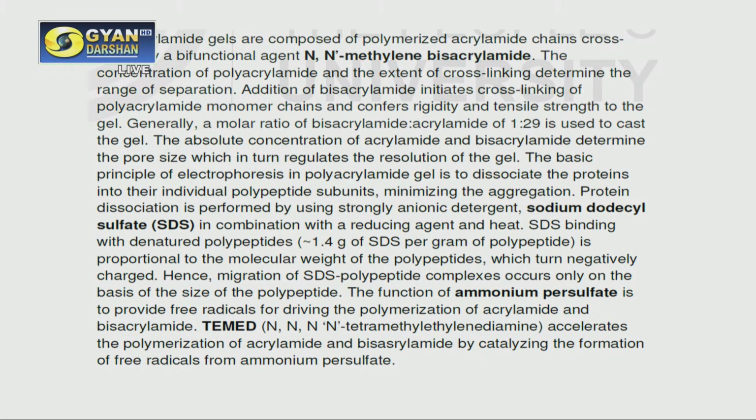This is actually the recommended concentration, that is bisacrylamide to acrylamide. The molar ratio should be 1:29. That is normally used to cast the gel. What is the function of bisacrylamide? It initiates the cross-linking. I mean, it strengthens the cross-linking of the polyacrylamide monomer chains.